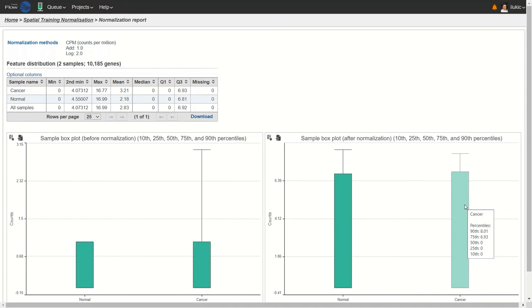And looking at the plot, we don't really see the lower whisker, right? We don't see the full box, and yet that can be easily explained by looking at a percentile. So here, most of the data, or half of the data, are down there with the median and the lower quartile and the lower whisker. In other words, data are kind of skewed, and I don't really like that. So let's take a look at the result of the SC transform instead.